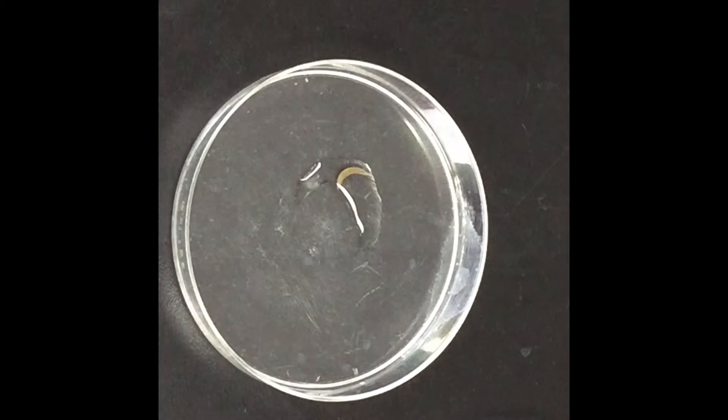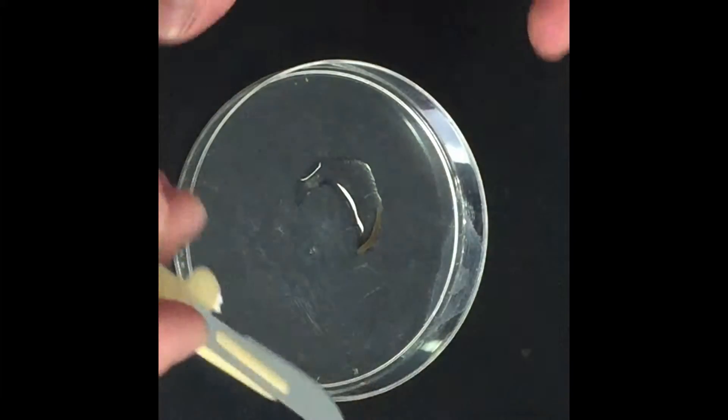I've got a flatworm planaria in a petri dish and I'm going to try to replicate an experiment I did in high school a long time ago to see if my memory serves me right. I'm going to cut this worm in half and see if the top half generates a new tail and the bottom half generates a new head.